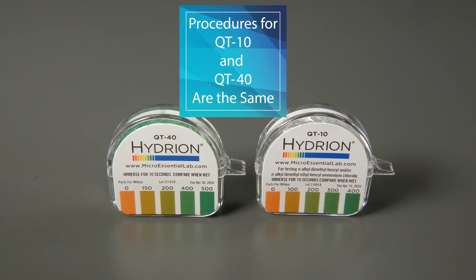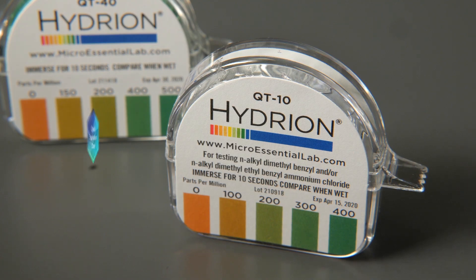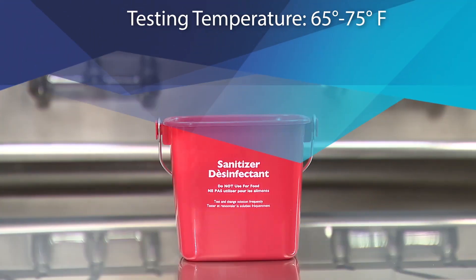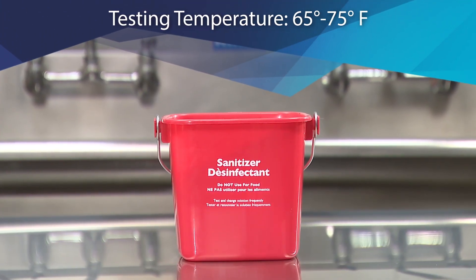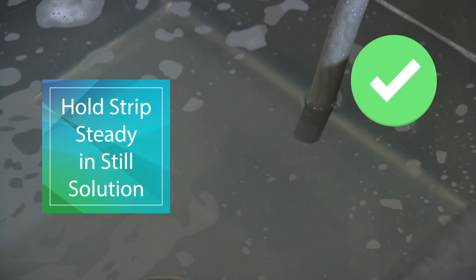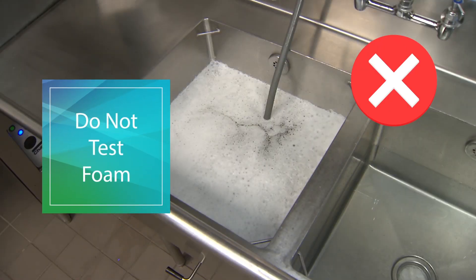The test procedures for QT10 and QT40 kits are the same. Always check the expiration date before use. The QUAT test solution should be between 65 and 75 degrees Fahrenheit. Make sure the solution is still and the foam is dispersed. Moving the strip or testing just the foam can lead to elevated readings.